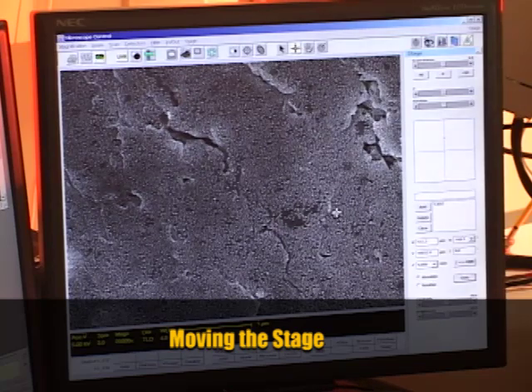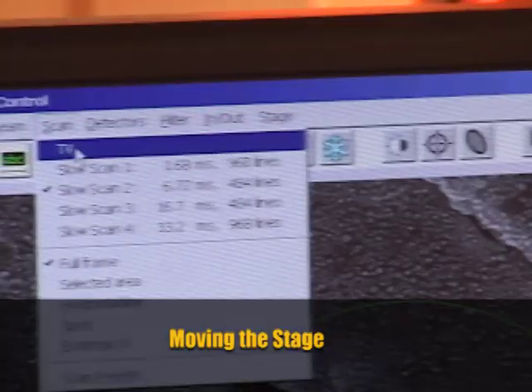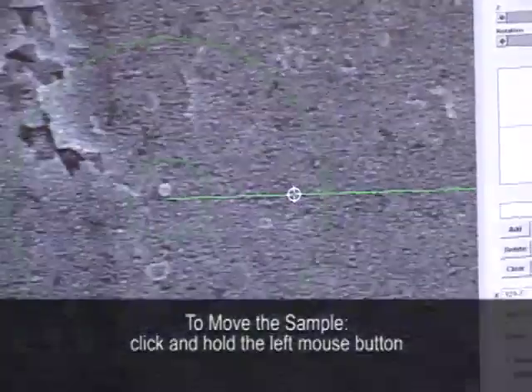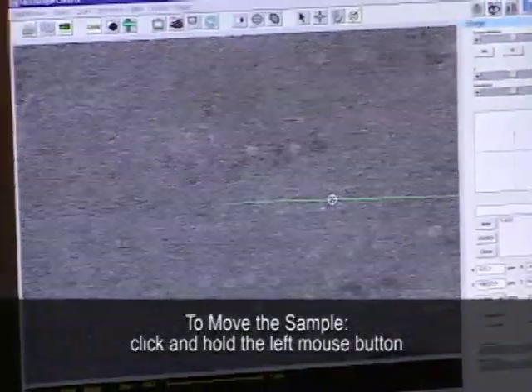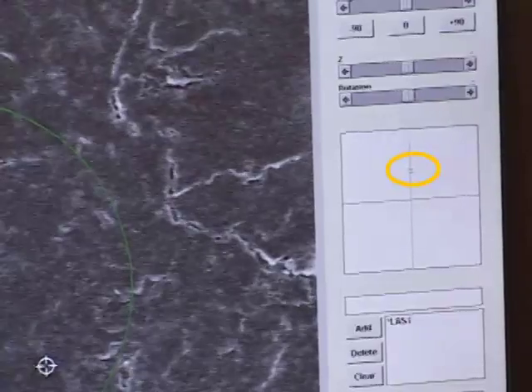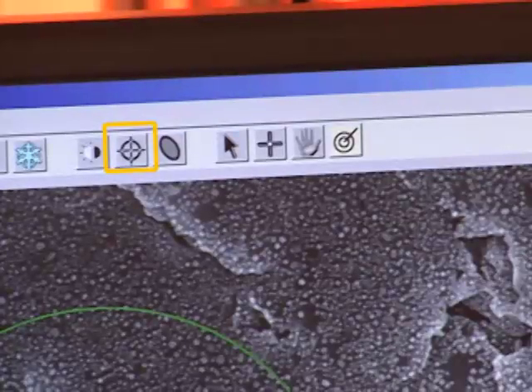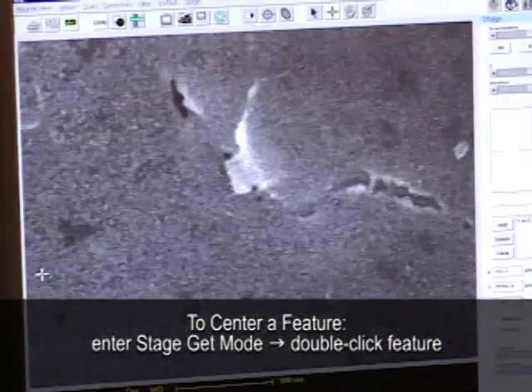After you've imaged one area of the sample, if you want to move to a new area, you change over to the stage track mode, change the scan rate to TV, and then just left click anywhere outside of the donut hole. You can see we're moving the sample to the left, so we're imaging more to the right side of it now — we're only moving in really small steps of about one micron. If you want to move faster, you need to zoom out to move to a new part of the sample. You can also track where you're moving by watching the X on the stage table. When you get to a new area of interest, you magnify, and when you find a feature you want to bring to the center, you change back to the stage get mode — the crosshairs — and double click on that feature.